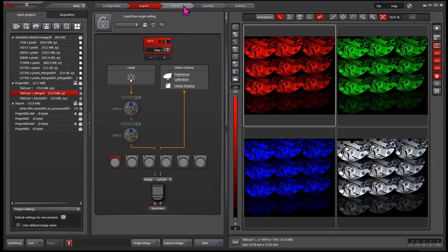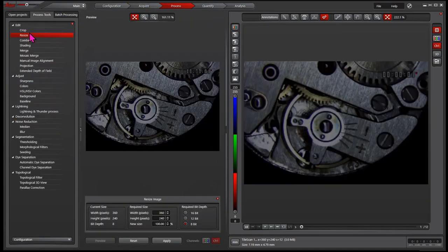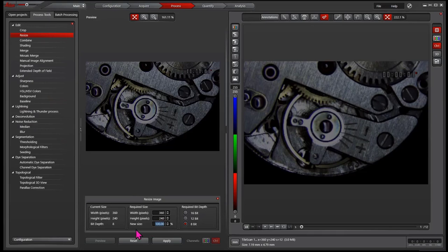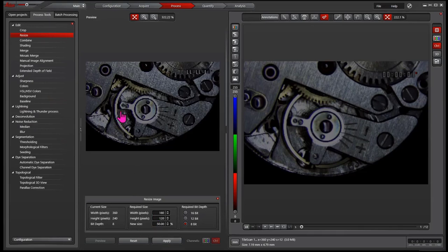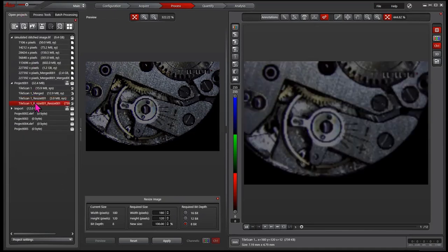There's another way to do it. You go to process. You choose the resize function. Then you can change the percentage here. Click apply. That will generate a new file with a smaller size. Either way, it's fine. It's up to you.